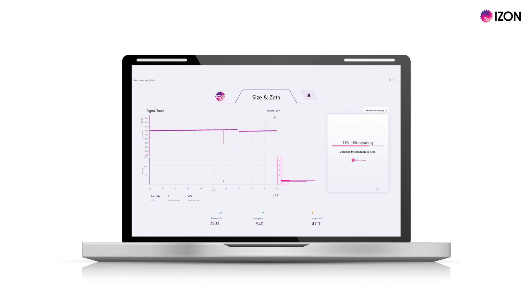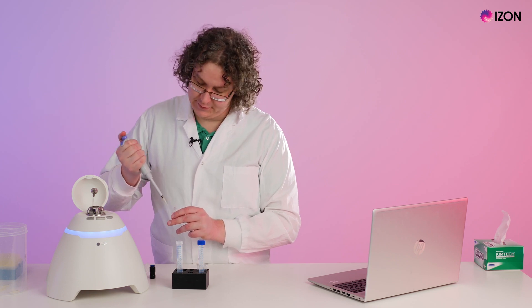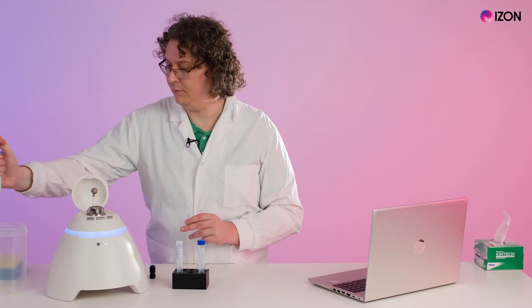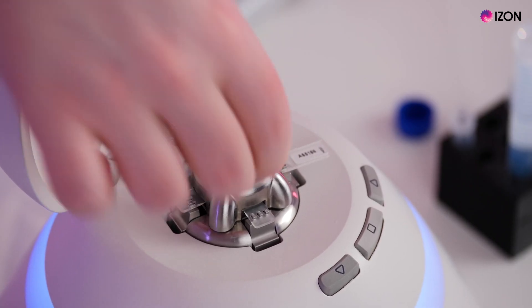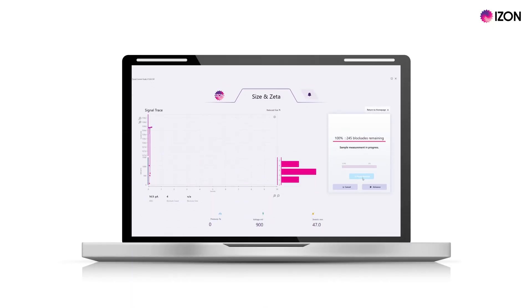Wait for the cleaning process to complete and click OK to continue. Replace the electrolyte in the upper fluid cell with 35 microlitres of your sample. Then insert the pressure nozzle, close the lid and select done. Press start analysis to begin your measurement.